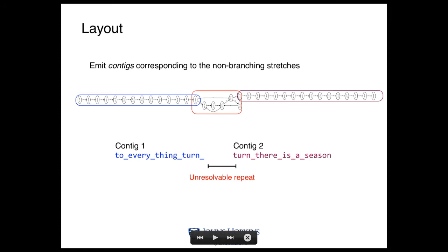Yeah, absolutely. When we were sequencing genomes with Sanger sequencing, there was quite a high standard to publish a genome. People would want very long contigs. They'd want the contigs built into higher order structure, which we call scaffolds, which I'm going to come to a little bit later. But since high throughput short read sequencing came out, the standard for publishing a genome dropped, and it was okay just to assemble things to 10,000 base pair pieces and then put it into a genome database. And people do go back, get long reads, get different types of information to try to finish or improve the genomes by filling in these repetitive regions.